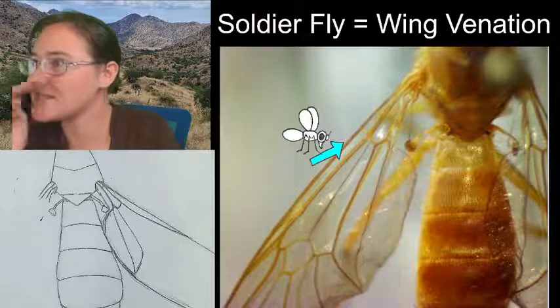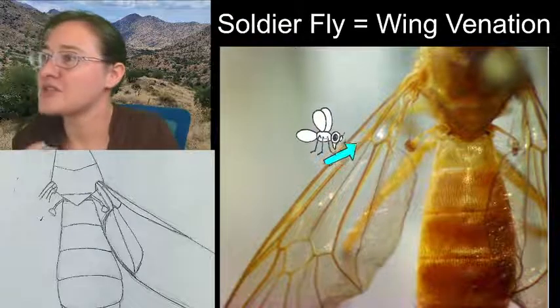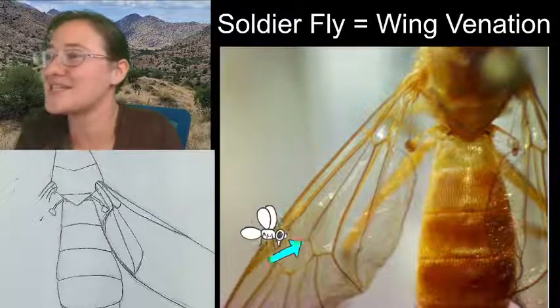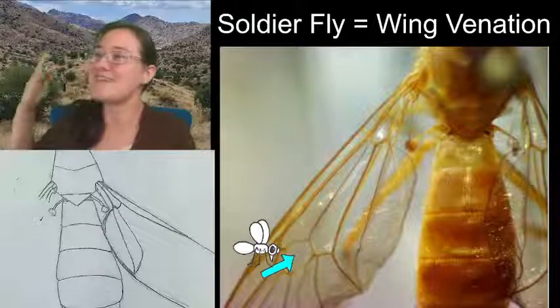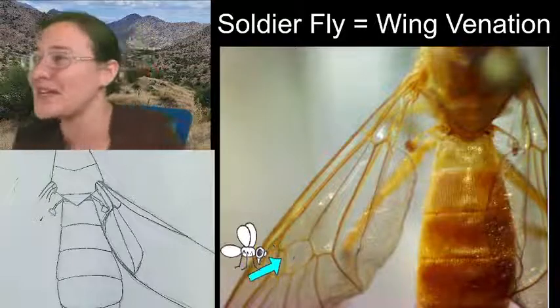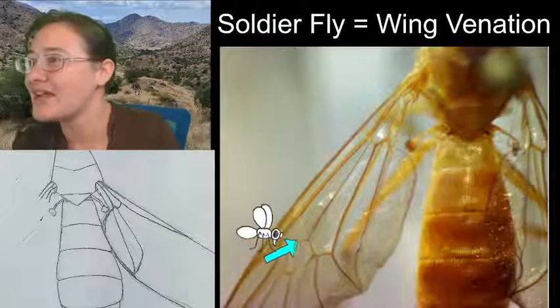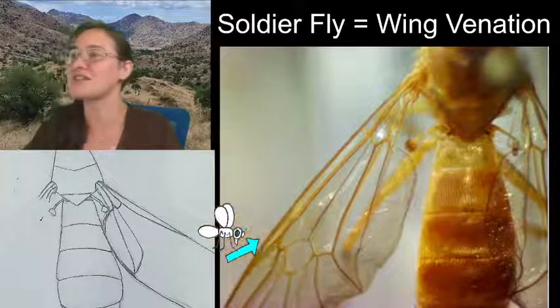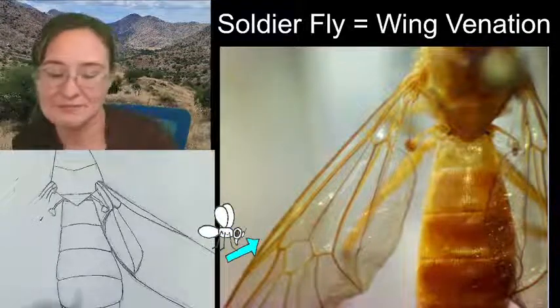All right, it creates the connection for this small vein that comes here and meets our pentagon. This is the D cell. This is the cell that matters, and it's the one that we're getting to. So I'm excited to talk about it. It has 5 sides, 1, 2, 3, 4, 5, and is the characteristic for our family.